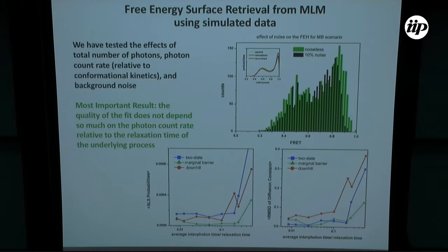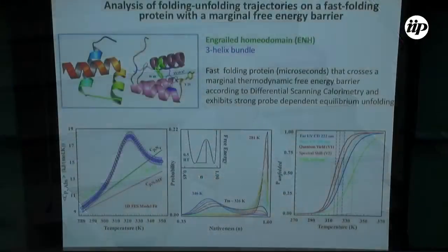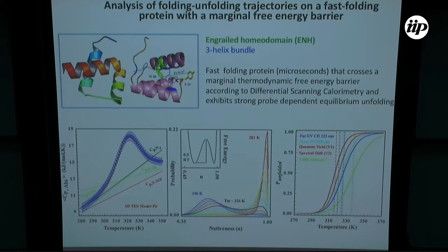What that means is, obviously, practically, we are increasing the time resolution of this analysis by a factor of 5, just by doing this. And we are also handling noise much better because we have a clear way of weeding it out. Okay. So now let me just show you some experiments. This is unpublished, but quickly because I don't have much time. I would like to finish before time.